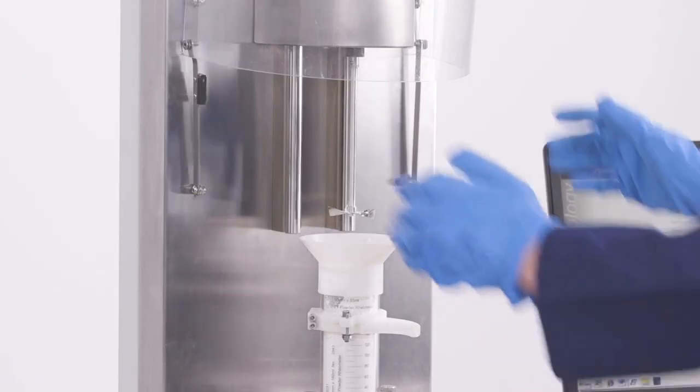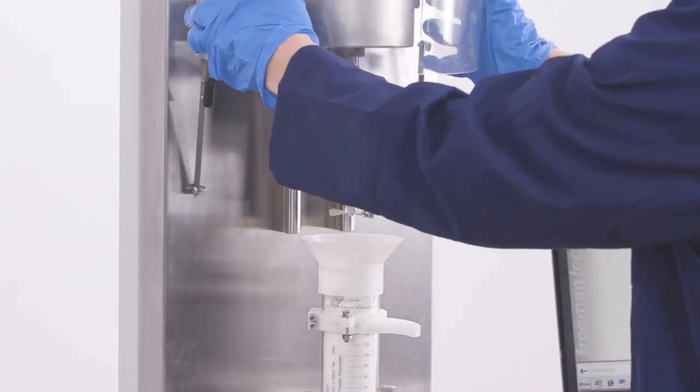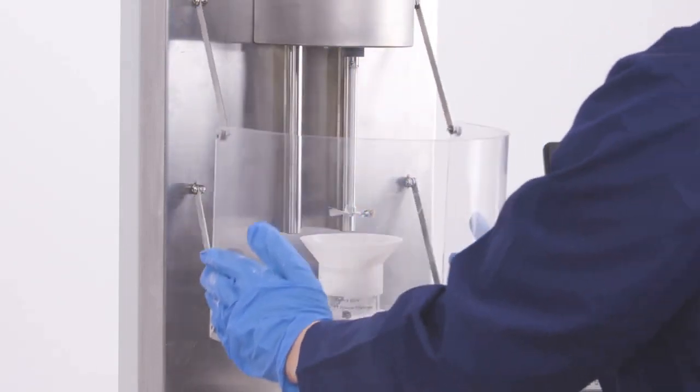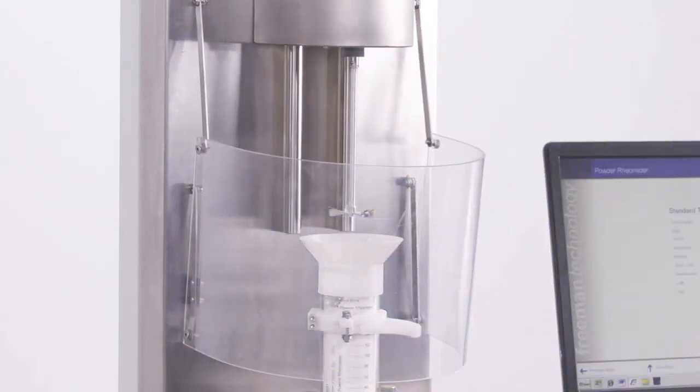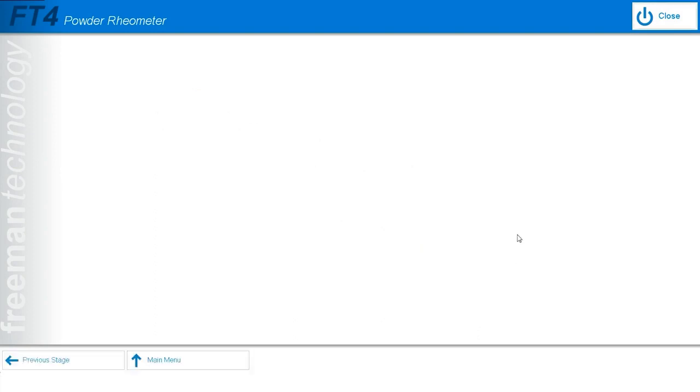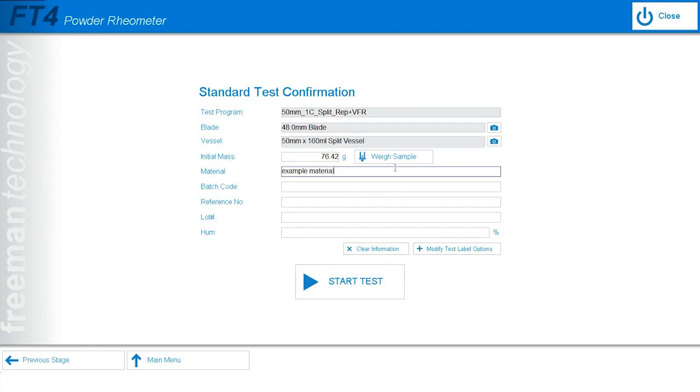Next, I'll make sure the safety shield is down. Once the mass reading stabilizes, I can record the sample mass. I will then be greeted by a data label screen where I can input any information about the material that I am testing. For this demonstration, I'll write example material and then I can click start test.